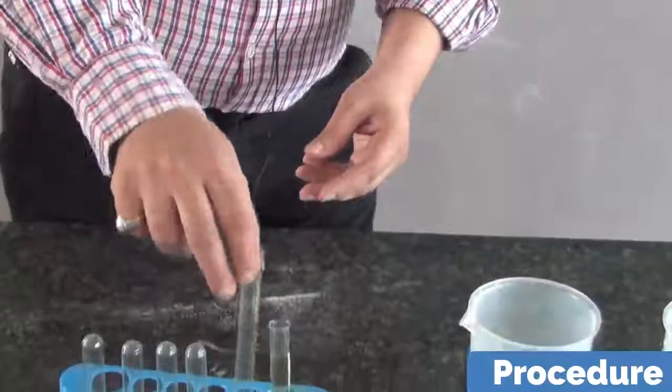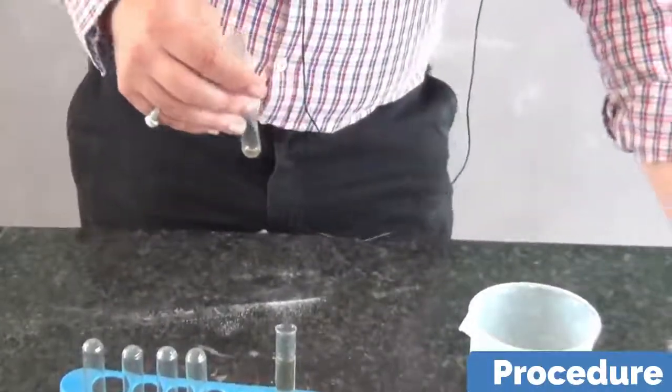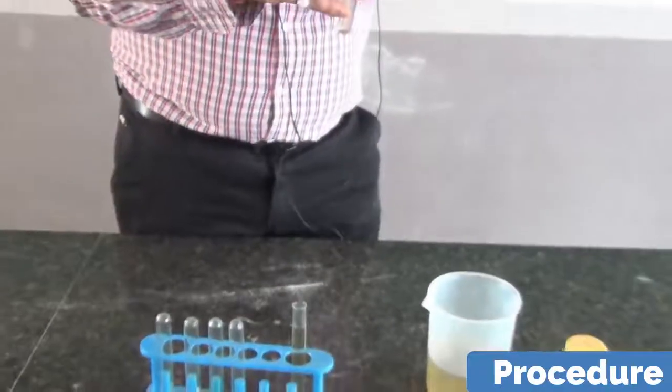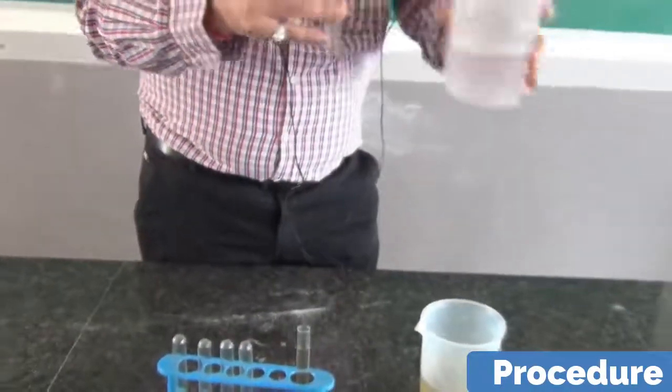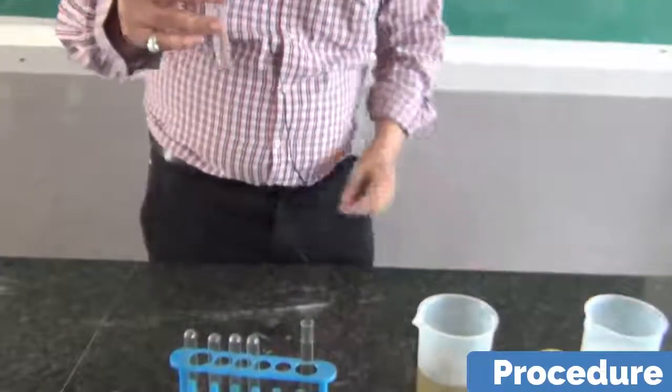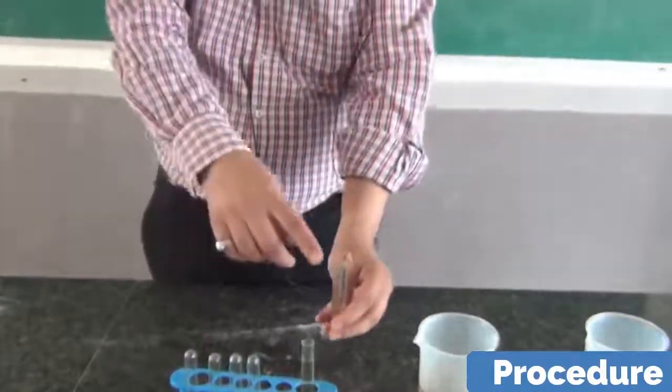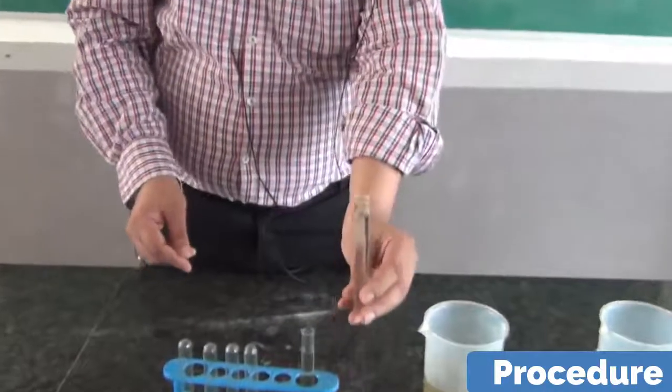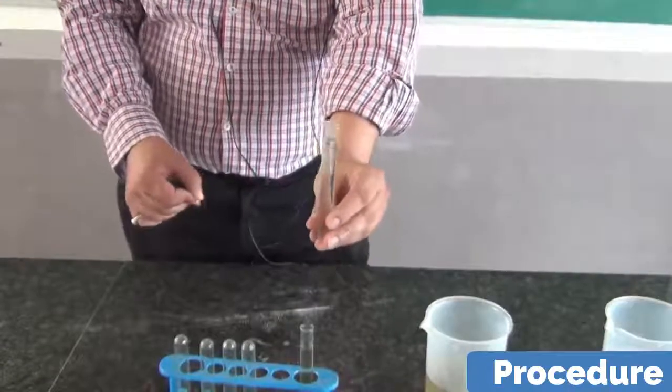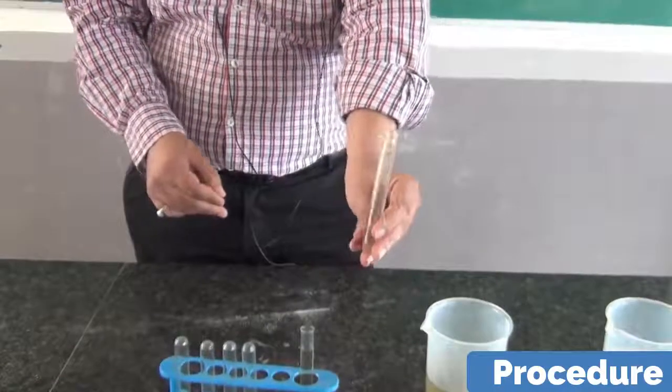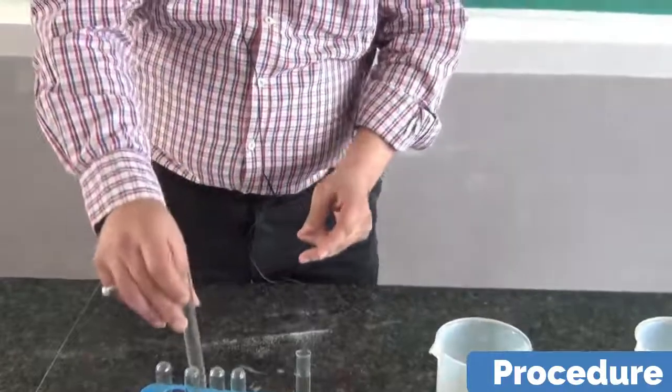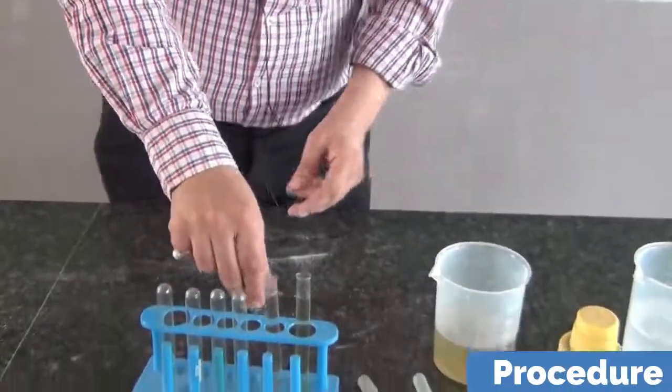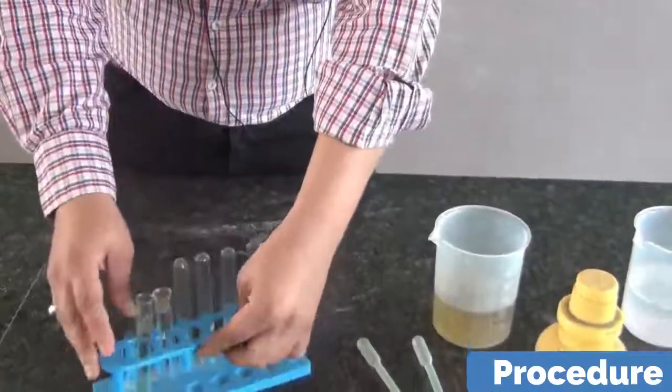Then we are going to test another water sample brought from industrial area. You see another water sample. You can see some air bubbles here. This water sample has been brought from the industrial area, from the waste water of the industry. I am keeping this at the other side of the rack.